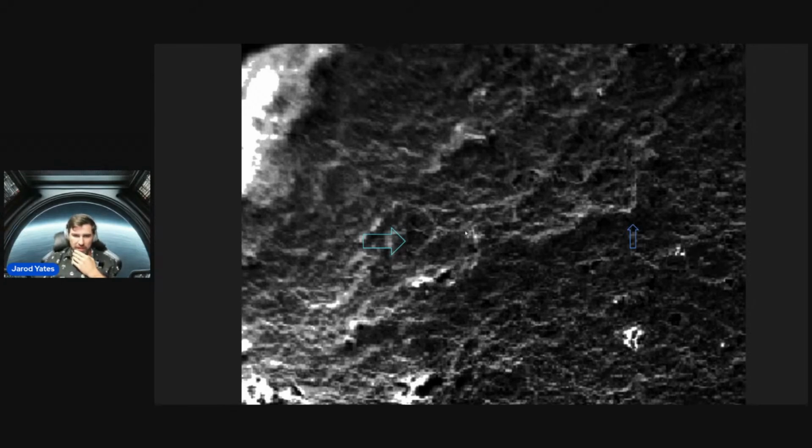But this one really caught my eye. You can see one of those center cylindrical structures, and you see 3 legs coming off of it. It seems to me like that's weird. I can't say for sure one way or another whether there's something important about that, but it really caught my eye because it seems like there's a semi-regular angle between these 3 legs of this thing. I can't even begin to imagine what's going on with that, though. Just something worth looking into.